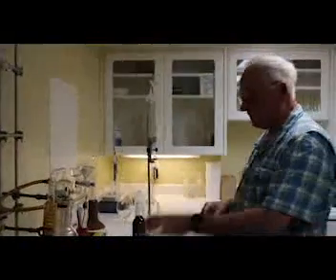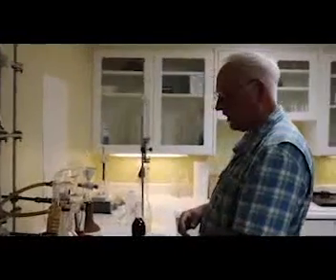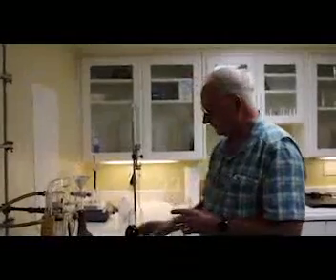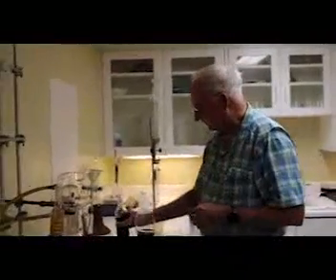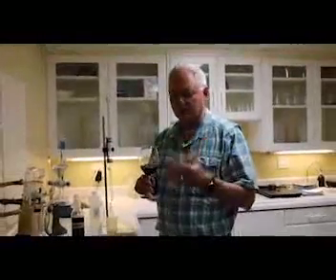And then after we get that distillate off, then we're going to titrate, and we'll show you how that's done after this finishes up. In the meantime, it's very important when you're doing lab analysis to also do sensory analysis. And so it's very important to smell the wine, because you can smell VA depending on the levels.